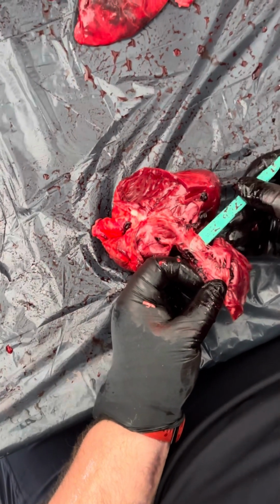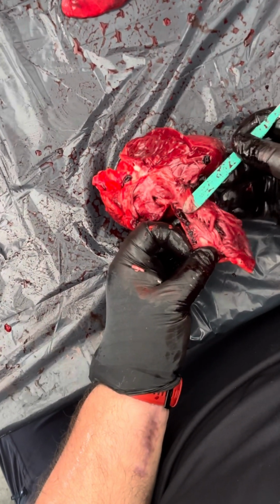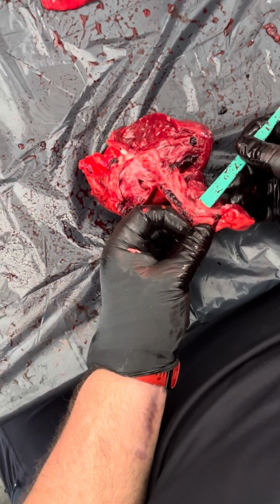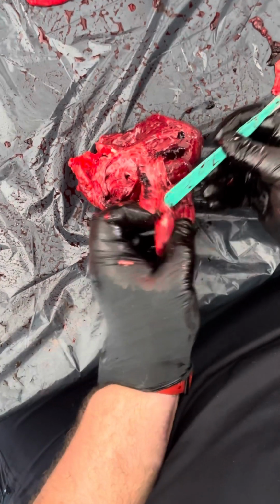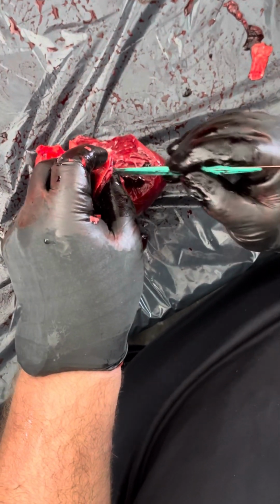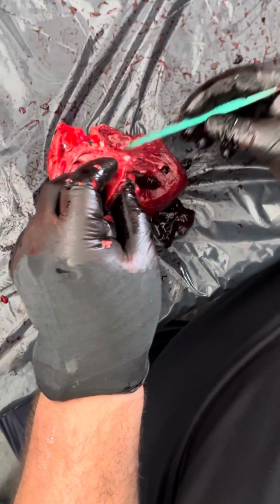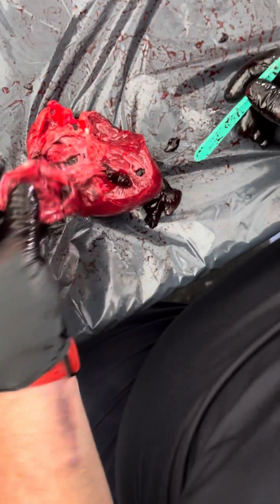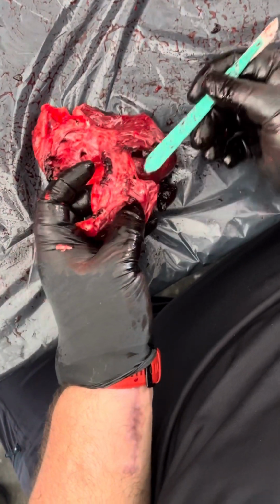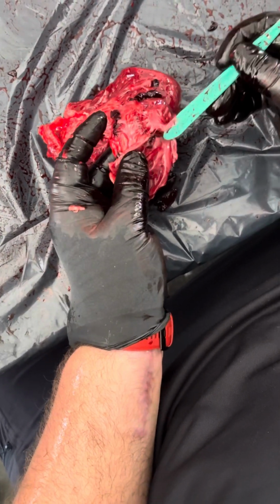So there's 1, all those strings, those are chordae tendineae. There's the second leaflet of the valve. It's here. There's 1, 2, 3. Right side, tricuspid valve. All of these big, thick tendons, these are your chordae tendineae. All of this stuff is papillary muscle.